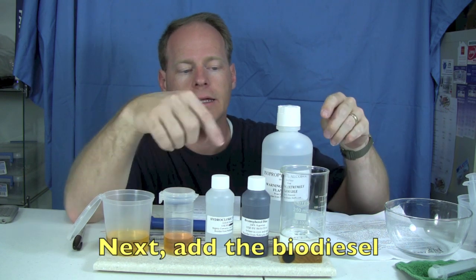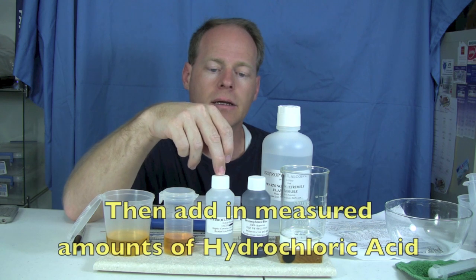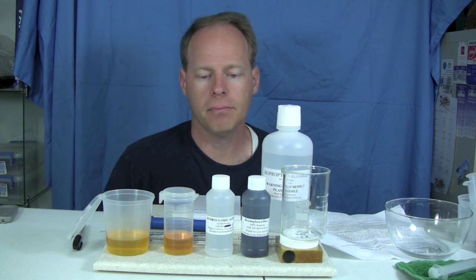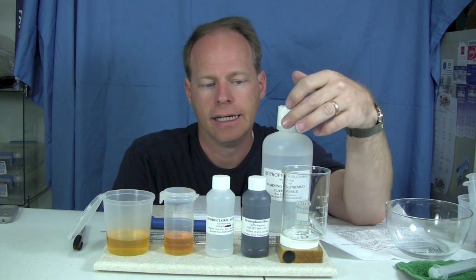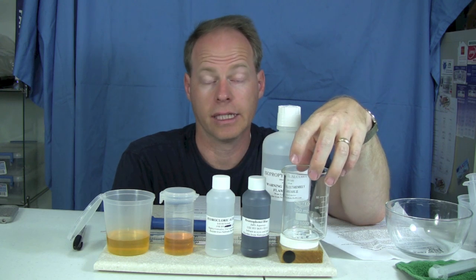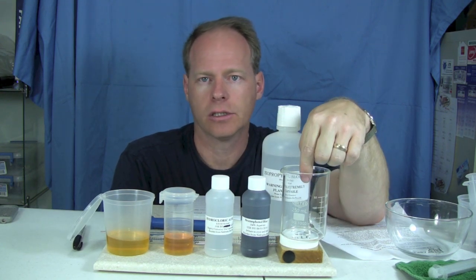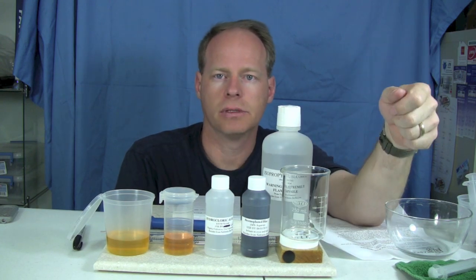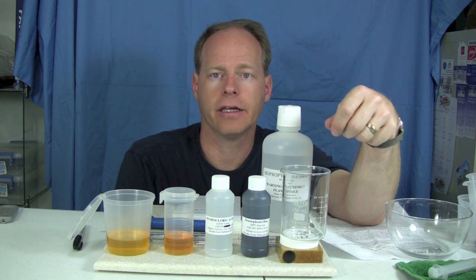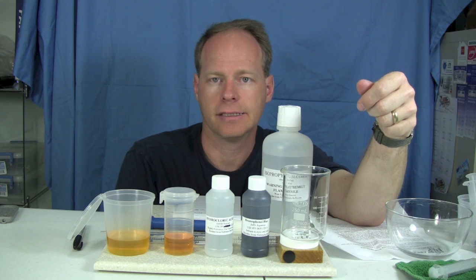Once we put our isopropyl alcohol in here we're going to blue it using bromophenol blue to get it a nice blue color. Then we're going to add in our biodiesel. Once that's mixed up and going well, we'll start measuring in measured amounts of hydrochloric acid. The theory is that soap is basic in nature, so we're trying to neutralize it with an acid. We identify how much acid it takes to neutralize the soap and that tells us how much soap is in the biodiesel, confirming if levels are acceptable for a diesel engine.